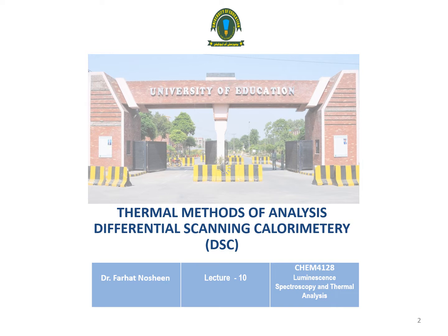This is lecture number 10, and in thermal methods of analysis, last time we already discussed differential scanning calorimetry. So we will further discuss differential scanning calorimetry or DSC in this lecture. Let's start.